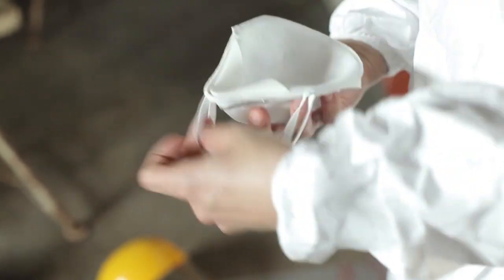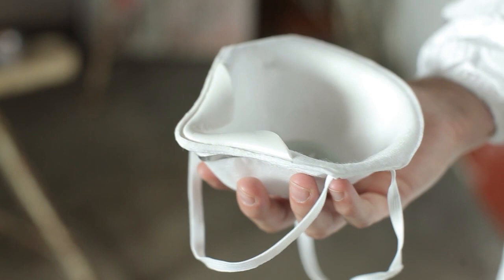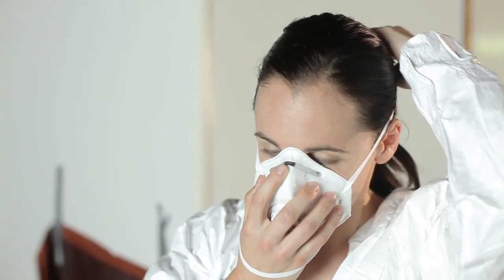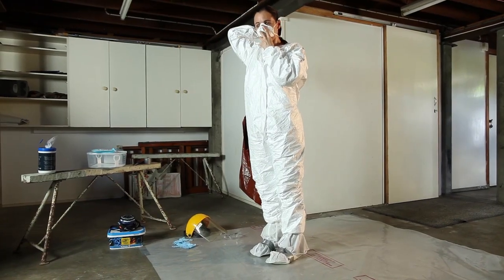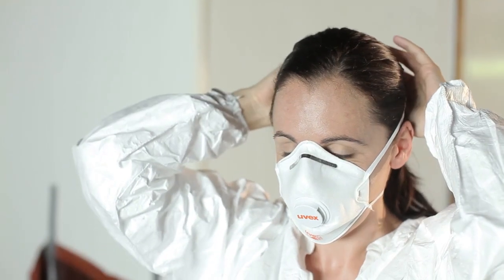When putting on a disposable respirator, hold it in your hand with the nose piece at your fingertips, allowing the head straps to hang freely below your hand. Position the respirator under your chin and over your nose and hold it firmly in position. Pull the elastic straps over the top of your head. The bottom strap should be below your ears and the top strap high on the back of your head, above the ears.